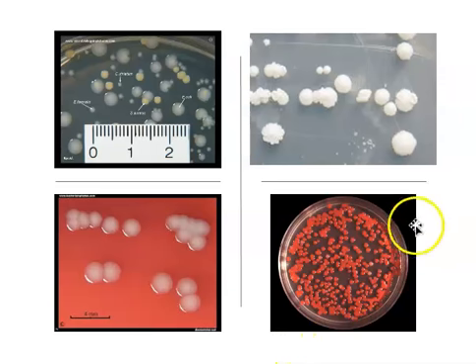And the last thing to look at over here on this 4th plate is this beautiful red color in these colonies. This organism is called Serratia marcescens, and it has this wonderful characteristic of growing pigmented colonies. And as you can see, it's a very vivid red color. This is a characteristic of this organism, this red color. There are other organisms that produce pigments that turn the colonies colors, but Serratia is kind of distinct in its beauty.